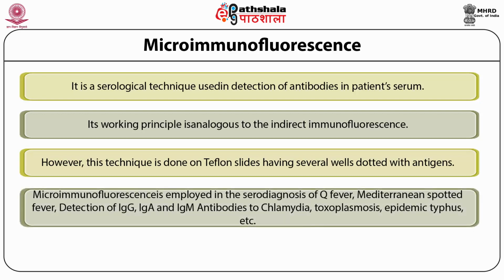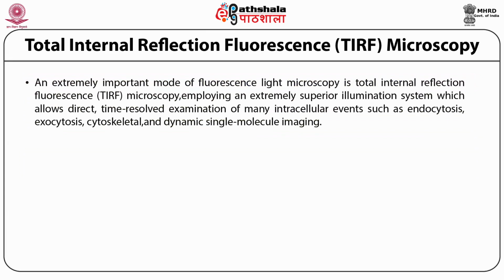Microimmunofluorescence is employed in the serodiagnosis of Q fever, Mediterranean spotted fever, detection of IgG, IgA, and IgM antibodies, chlamydia, toxoplasmosis, epidemic typhus, etc. of many intracellular events such as endocytosis, exocytosis, cytoskeletal, and dynamic single molecule imaging.